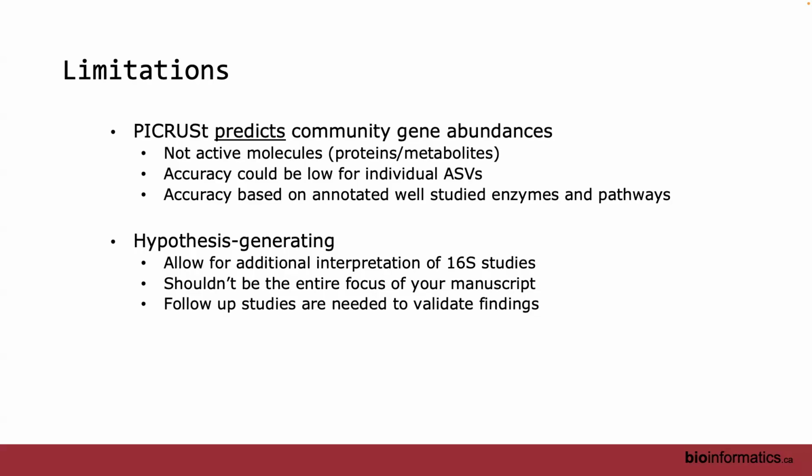And obviously with this, or even as you'll see later on with metagenomics, all of it takes a lot more validation, right? It's an idea of, hey, maybe I can chase after this and go down this rabbit hole. So that's my spiel on PICRUSt. Happy to talk about that more sometime. If there are no questions, I'll get Ryan to come up while I take more questions.